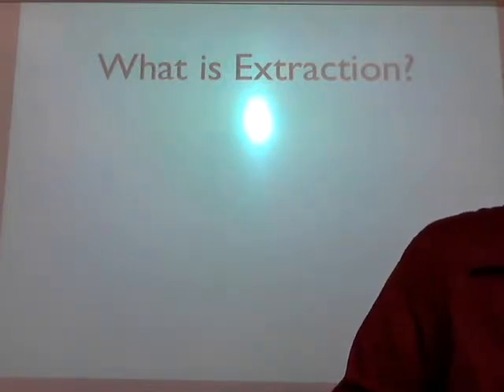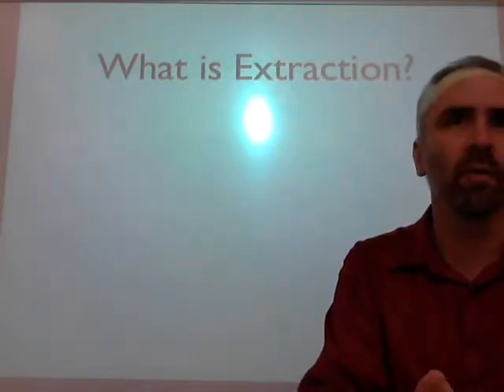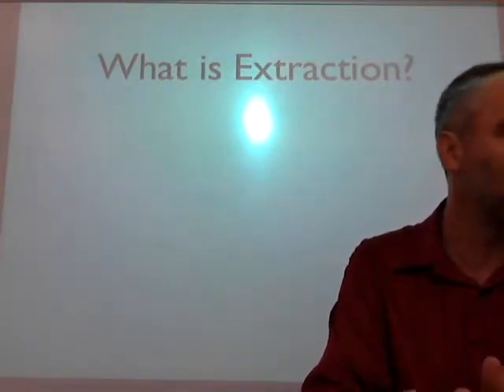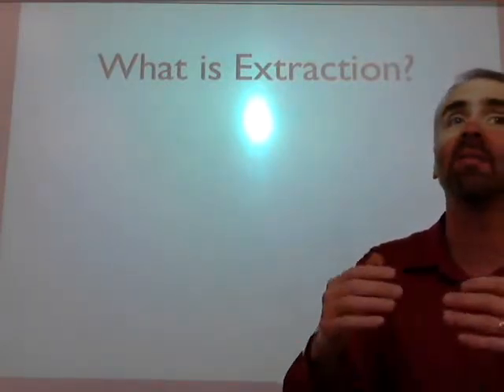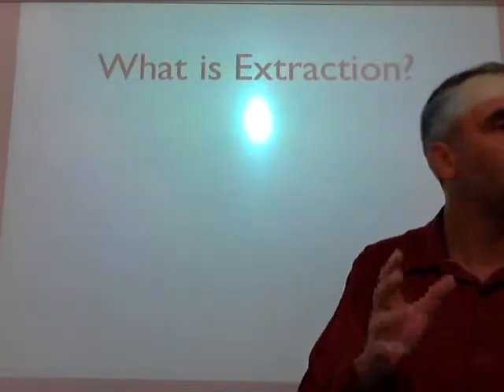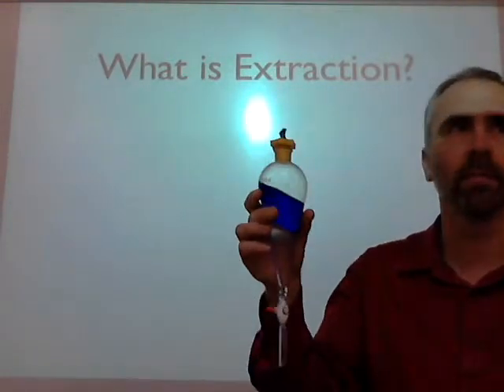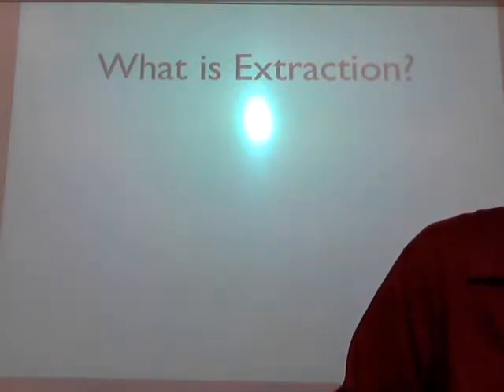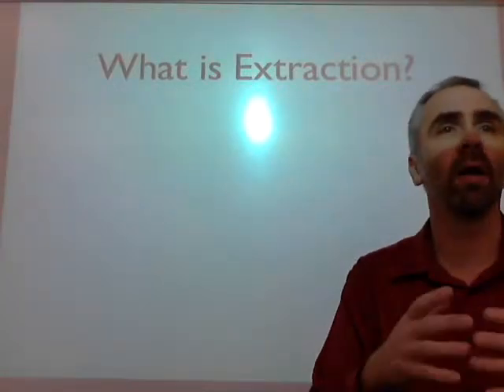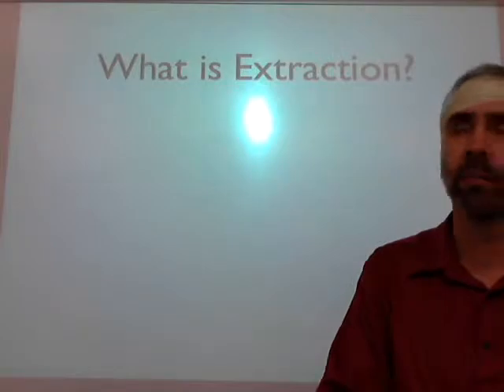Notice it's similar to the chromatography you just did. The difference is chromatography took advantage of the polarity differences and the solubility differences, but it had a stationary phase, the paper, and it had a mobile phase. Well, in this case, both phases are liquid. I don't have a stationary phase. So when you do this tomorrow, you have to find a way to extract that out. And I'll show you all the procedure, and hopefully you'll listen.